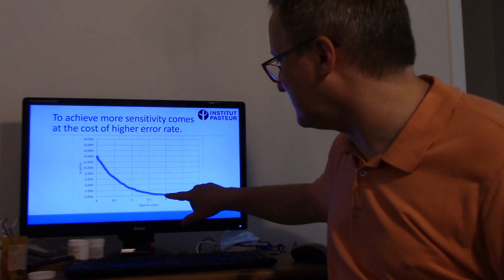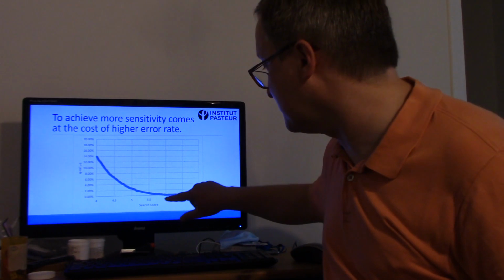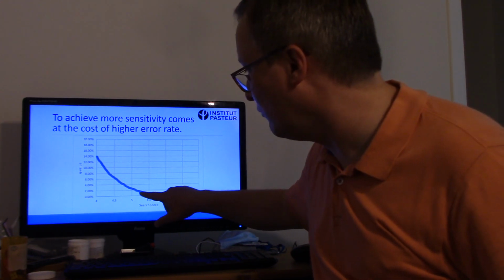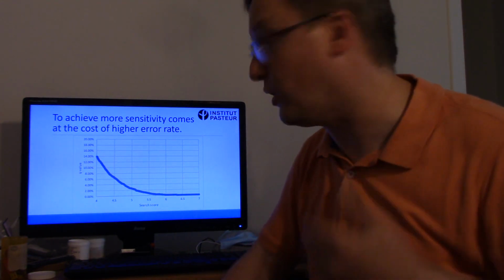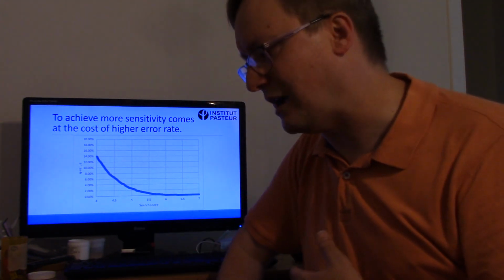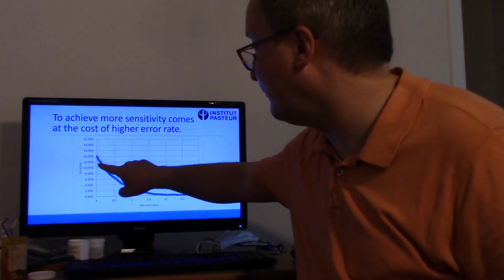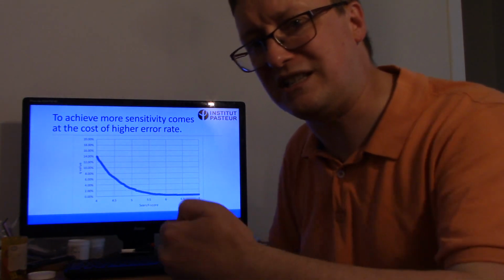Once we get to about 6, though, which was the mean value for correct scores, we see that we're accumulating some number of decoys. But this keeps getting worse and worse, and by the time we hit a threshold of 4, we have a pretty high error rate, that adding new PSMs is coming at an expected error rate overall of 14%.